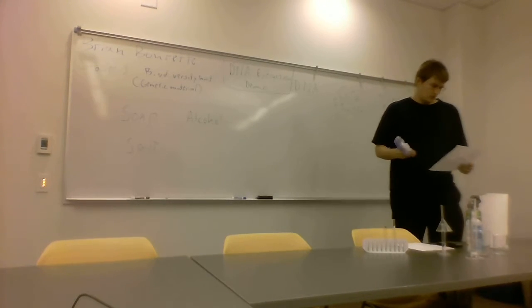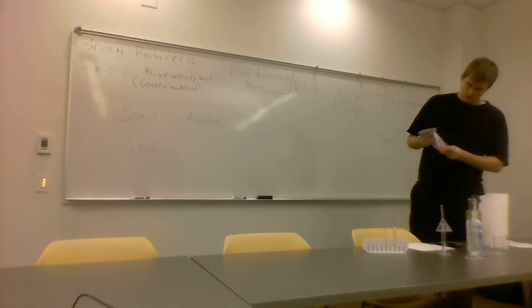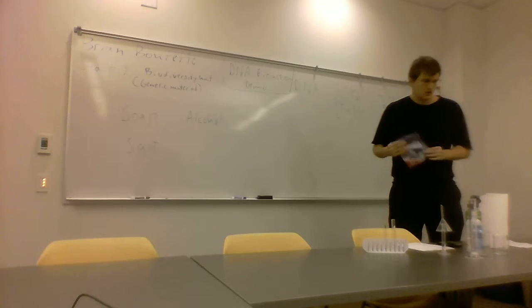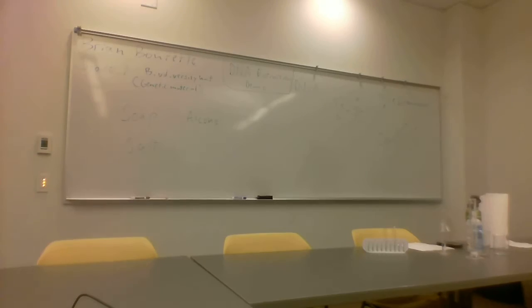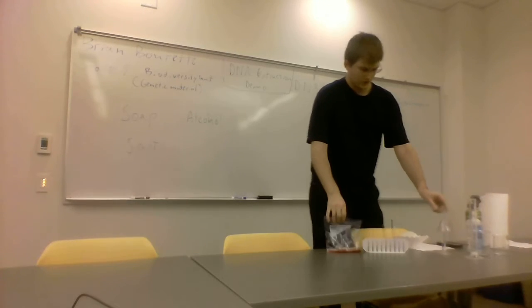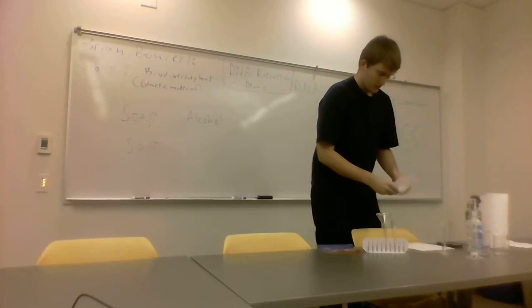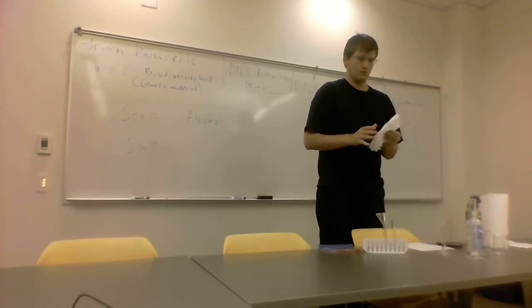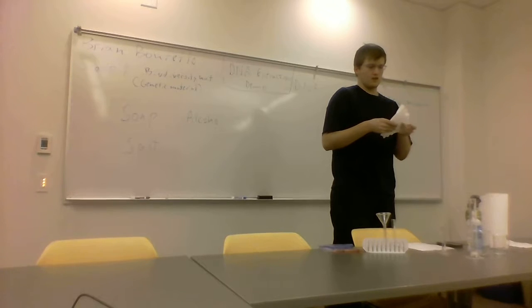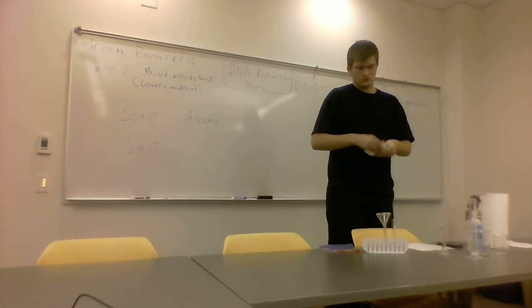So, now that this guy is pretty much mushed up, I'm going to go ahead and start pouring this out into a test tube and filtering it. We're going to use our basic technique here of folding our filter paper so that it fits. Nothing too fancy.